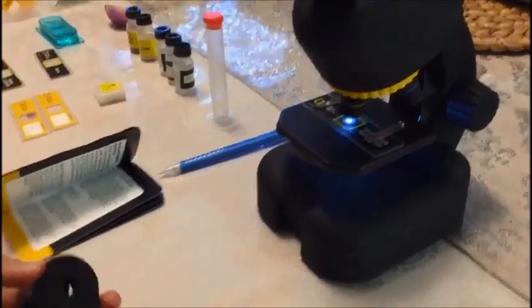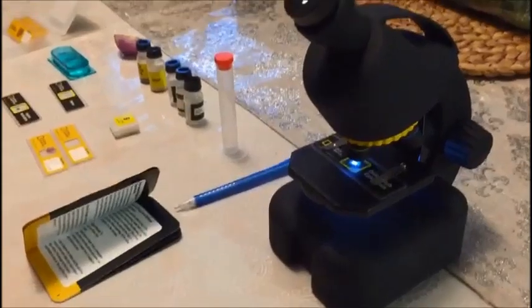Oh, and just to let you know — it has a smartphone adapter so you can connect it with your phone.